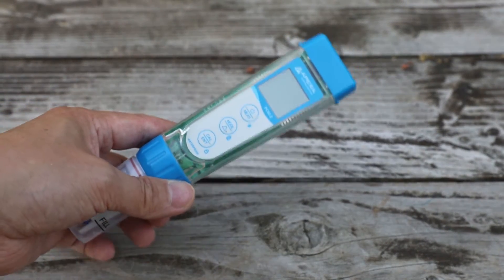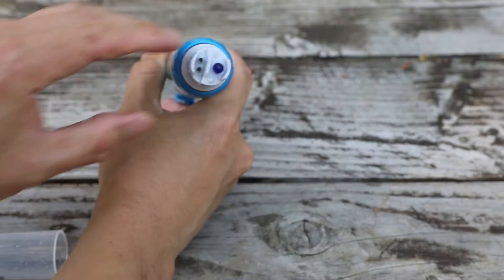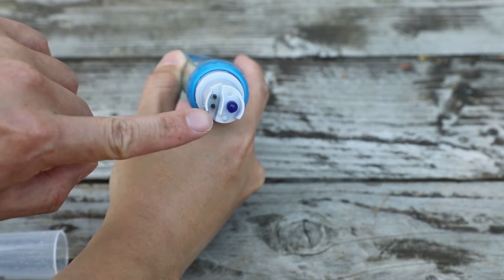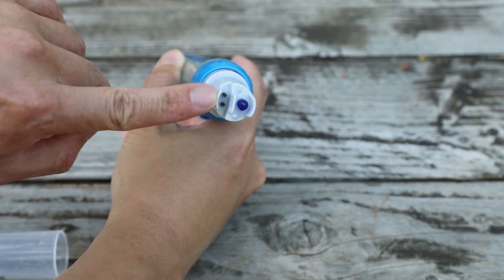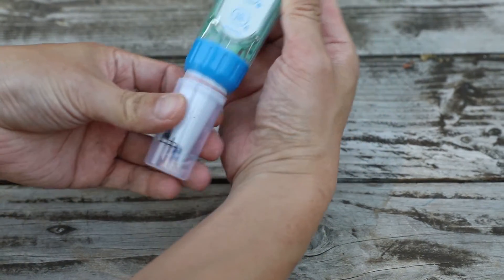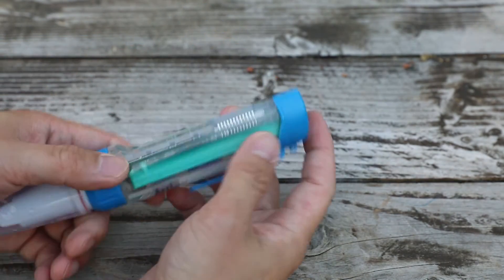Let's take a look at the tester instrument. At the tip, in the blue, you see your pH meter, and at the higher end you'll see your electric conductivity probes. It also includes a nice safety cap which has a marker line for the fill line.